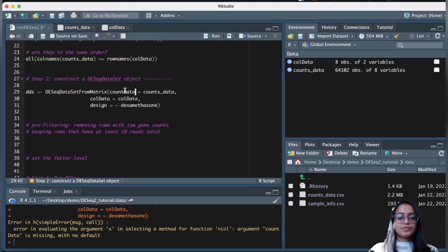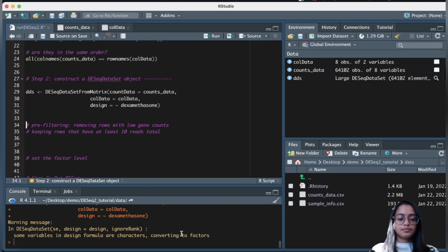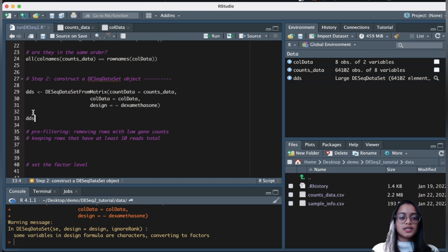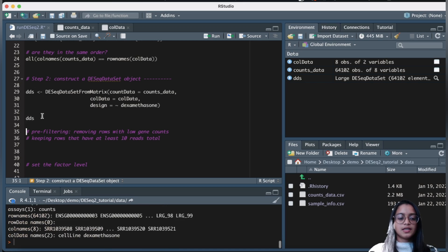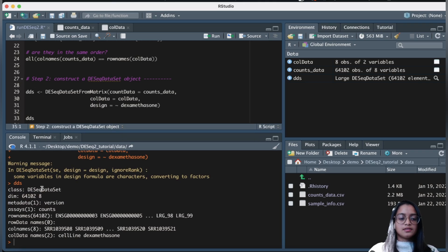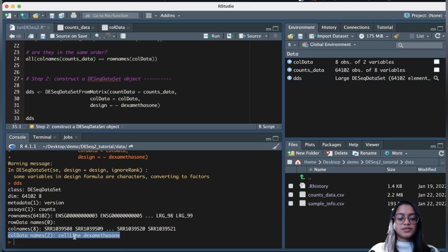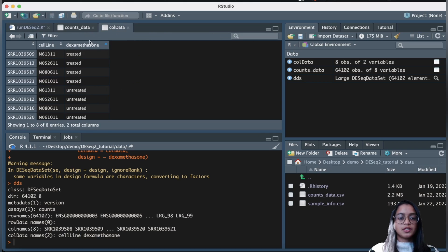I got an error because the parameter name was not 'counts' but rather 'countData', so I corrected that and reran it. Now we have our DESeq dataset ready. Typing dds, we can see it's a DESeqDataSet object with the expected number of rows and columns, row names as genes, counts saved in assay, and two column data variables: cell line and dexamethasone.